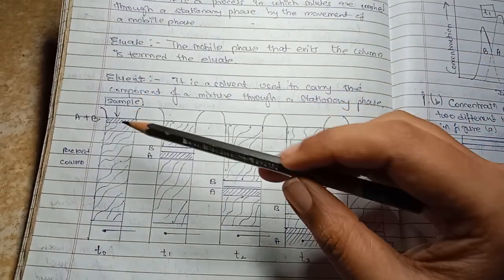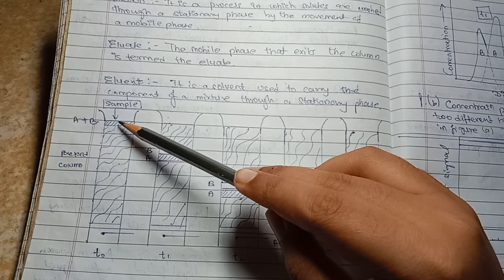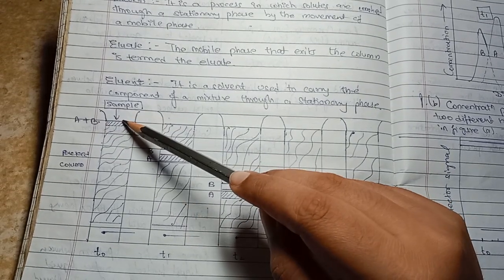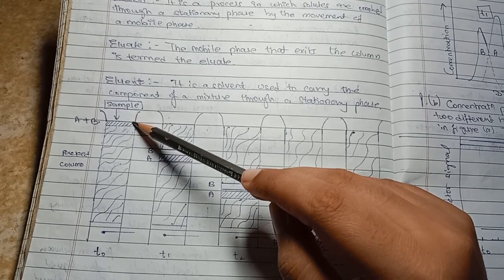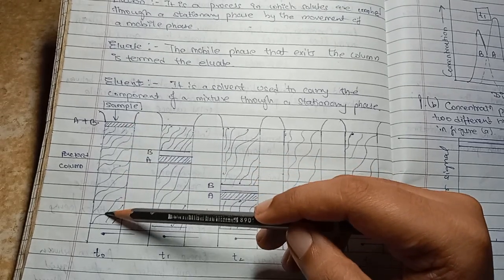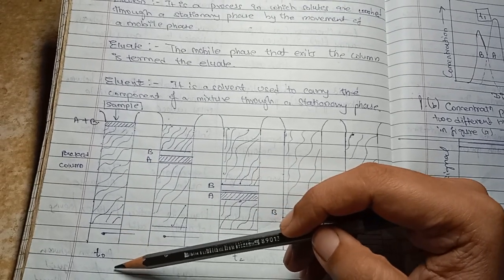That means, how the components of a mixture, which is termed A plus B, which is our sample, are separated through the packed column of stationary phase by the movement of the mobile phase, that we are going to see in terms of time.